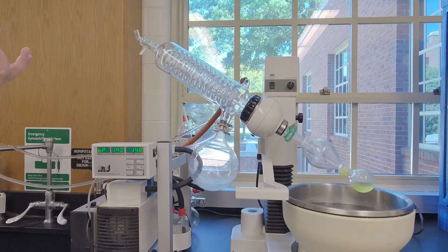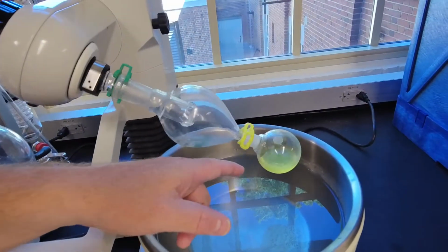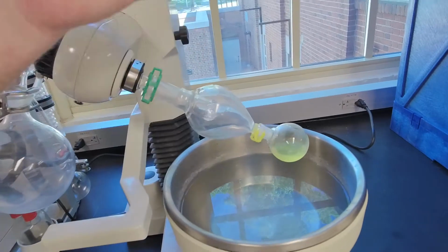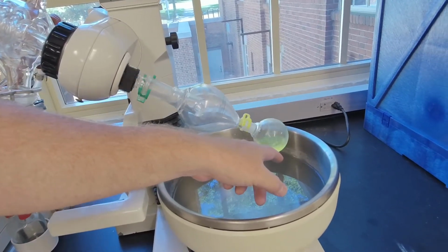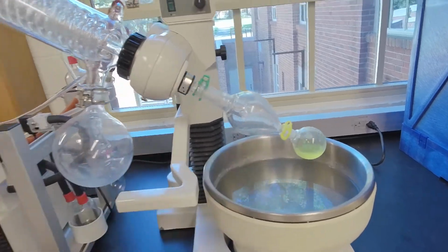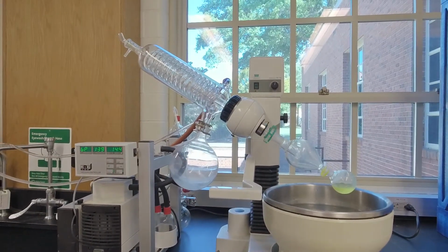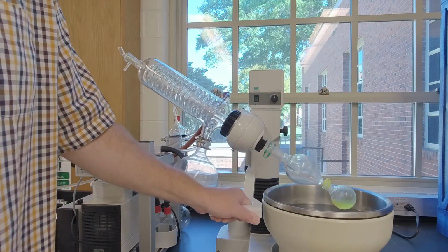And so the surrounding area becomes cooler. And you can kind of see this in this flask. It's starting to have a little condensation on it because the temperature of the flask, don't ever grab this, but you can kind of put your finger there. It's cold, right? So the temperature of that is going down. So we use the bath to replace the heat lost to evaporation.